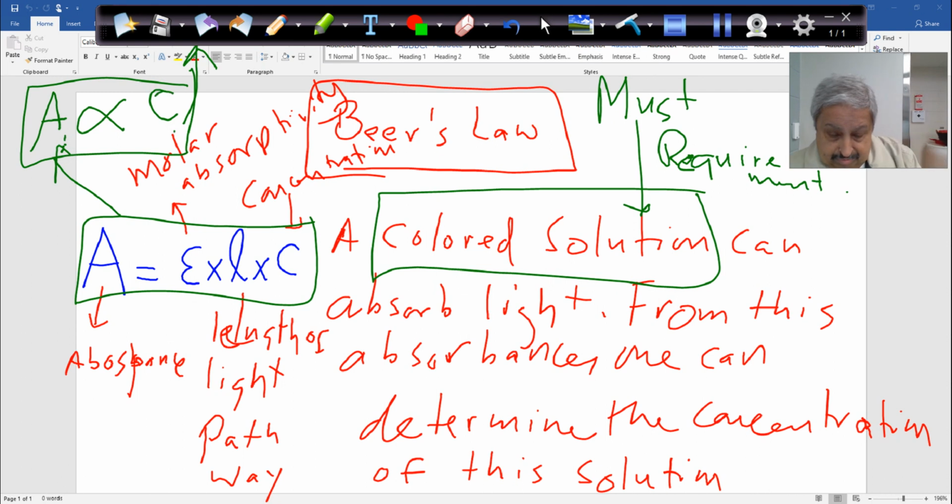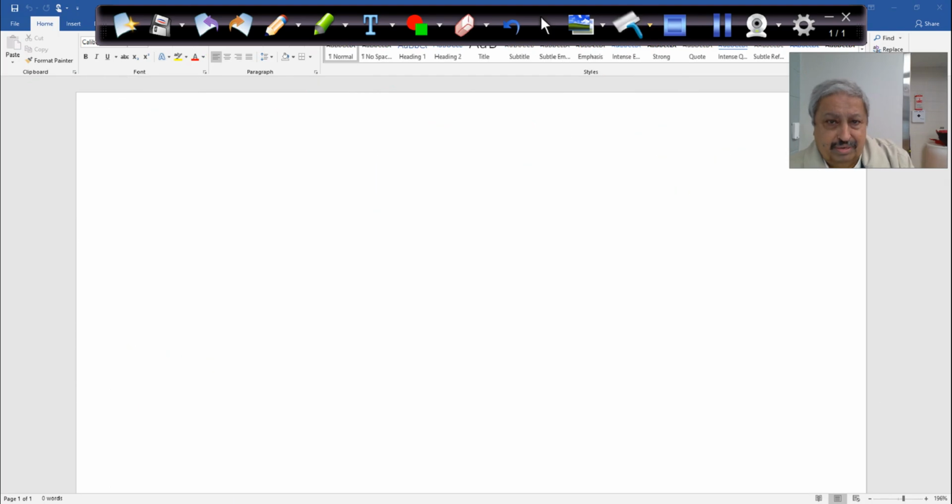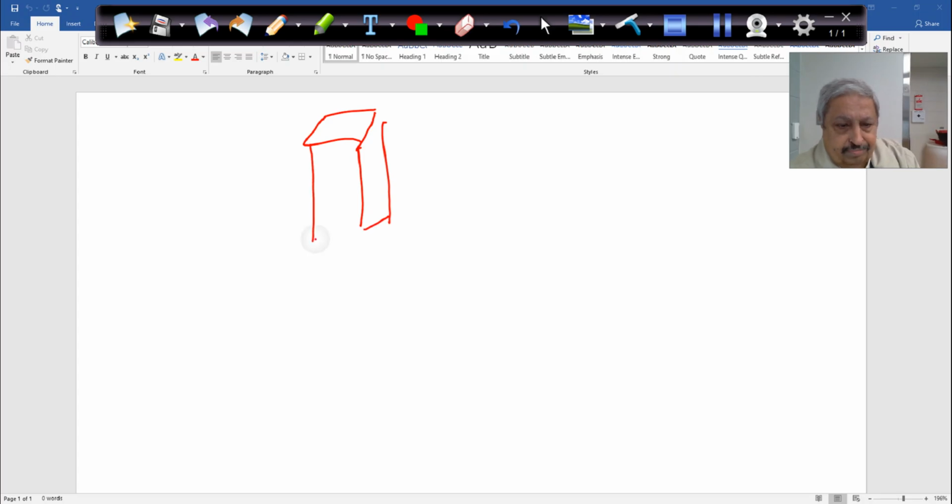Now, let's look at the picture here. Everybody has it? This is in the other video, the same thing, but I just want to explain it quickly. Today you will work with something called a cuvette.